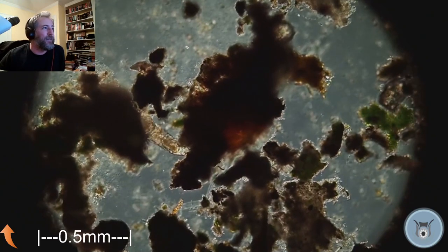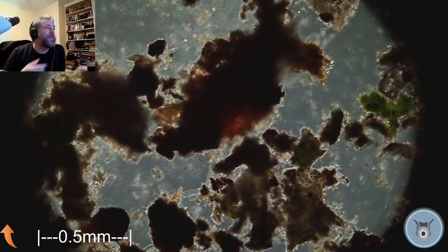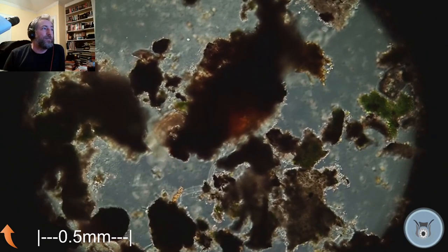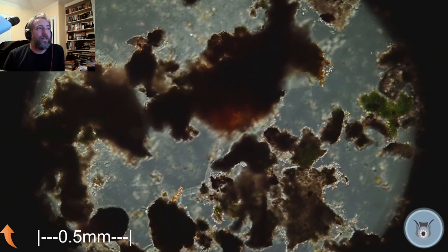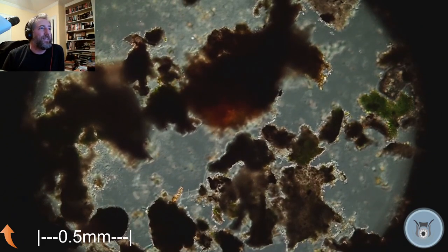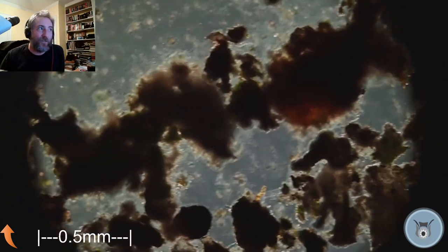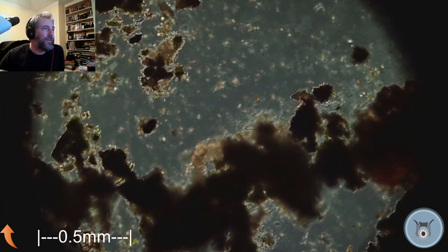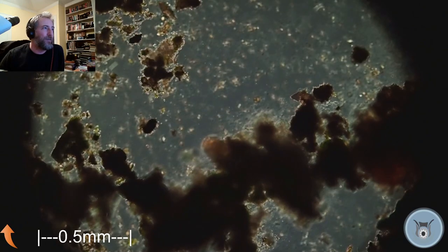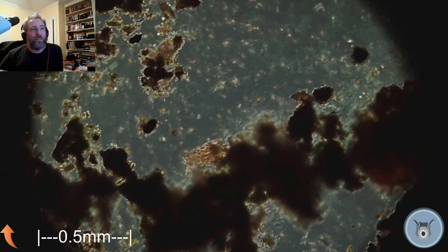And I say that, and I mean it kind of literally, because one of the ways that organisms can evolve is through genetic mutation. But the bdelloid rotifers basically repair genetic damage, and that's one of the ways that they manage to persist, is that they actually don't evolve. They've just stayed the same, and they've managed to basically repair genetic damage and persist as only females for 75 million years.